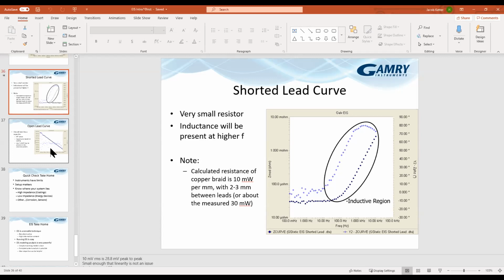If, on the other hand, you're doing potentiostatic EIS, your DC background is voltage. So you measure your open circuit, and in that case, your DC background stays at the exact same potential throughout. And if there is any drift in the sample, you actually see it in your DC current changing over time.